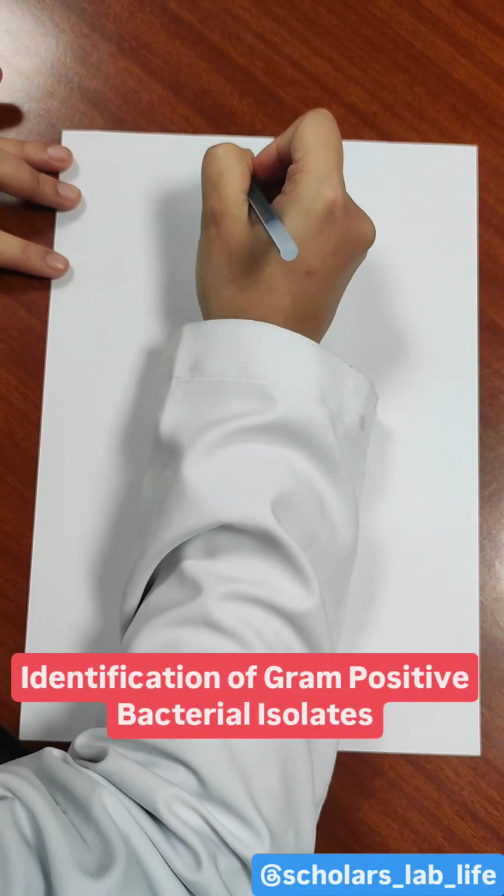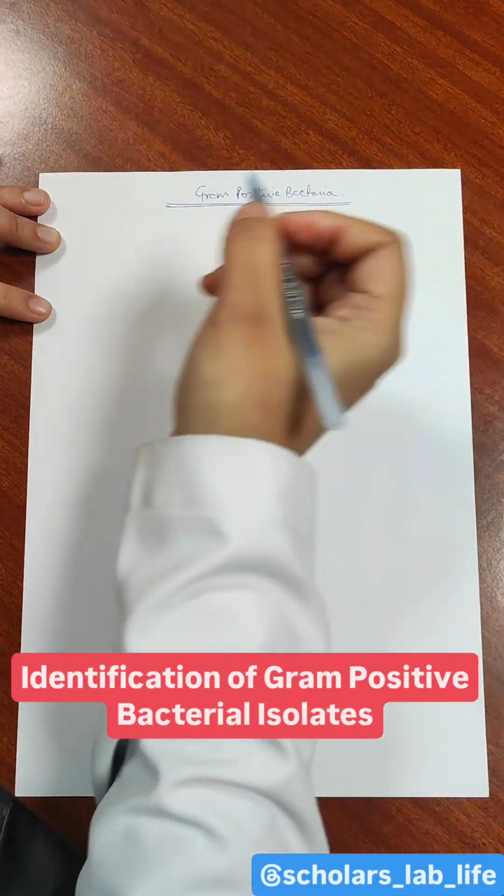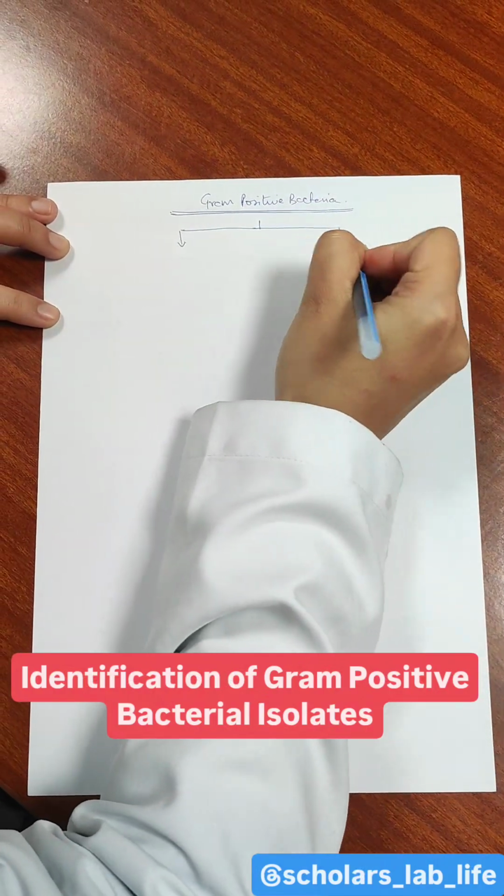Today we'll discuss the identification of gram-positive bacterial isolates. Although the identification of gram-positive bacteria is not very wide, we should still know the basic biochemicals which are required to identify these organisms.